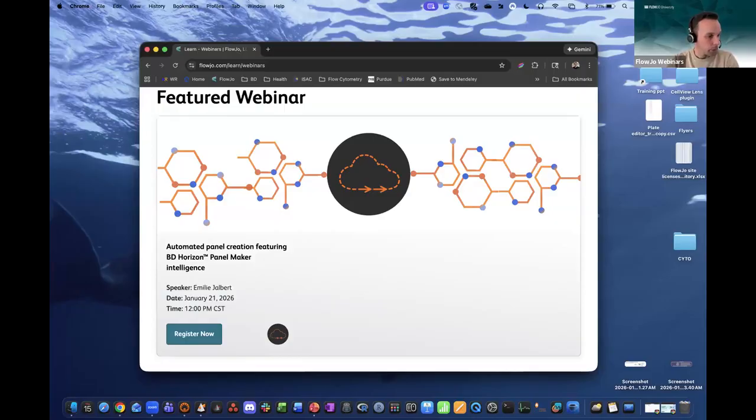If flow rate fluctuates but signal is stable, can I still take all the events? Yes, Gita, that's personal preference, or another algorithm, for example, PeacoQC, does not take in consideration the flow rate. So when you look at the QC, if you think that the flow rate has nothing to do with an issue on your sample, it was not a technical issue, it was just, as I mentioned, a change in the speed by the user, you can remove the flow rate in your QC.